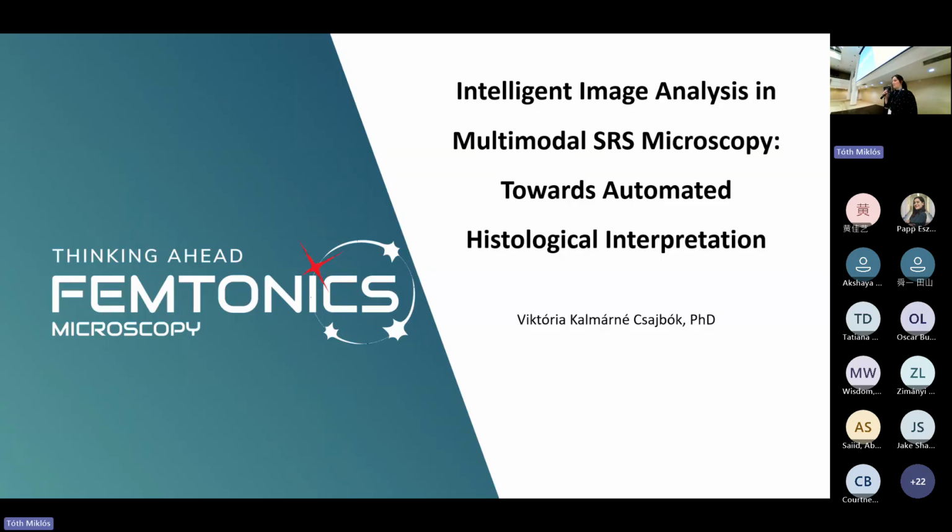My name is Viktoria Csajbok, and I came from a company called Femtonics, which is mainly known for its two-photon fluorescence microscopy solutions. But today I will present our other work, which is about intelligent image analysis in multimodal SRS microscopy.